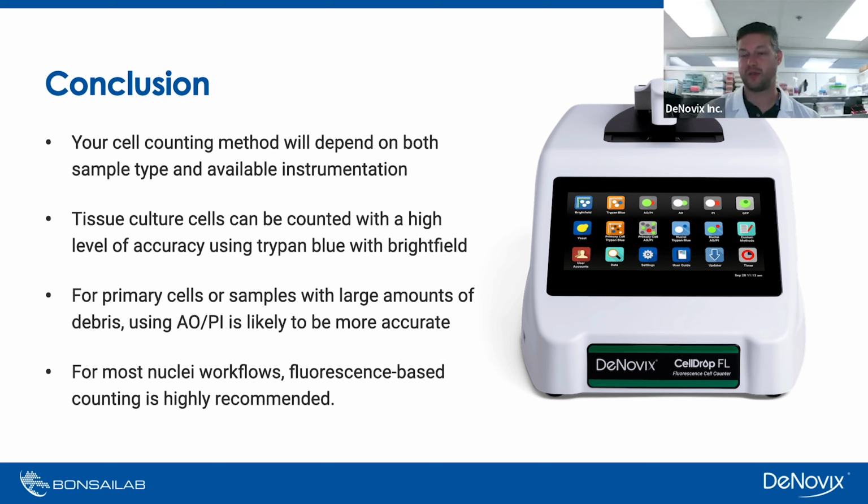And in fact, in the literature provided by companies that do nuclei isolations or downstream processes such as single cell sequencing, fluorescence-based counting is recommended for those workflows.